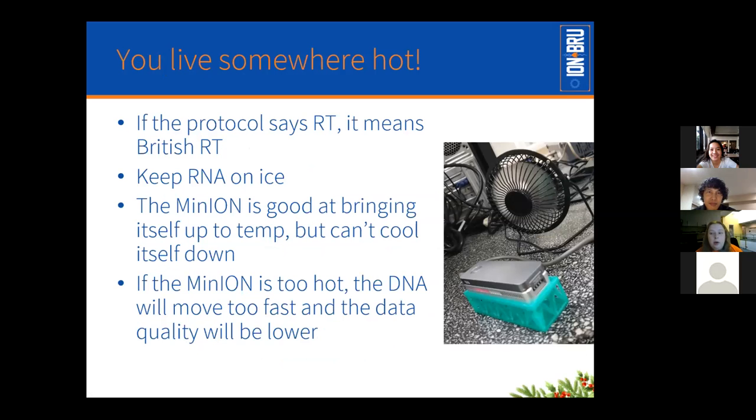You live somewhere hot. You're probably aware of this. It's hot where you live. And I'm sure you're used to protocols saying room temperature and not necessarily meaning room temperature. But definitely bear in mind that it's referring to British room temperature. And do keep your RNA and in fact most of the reagents on ice after they're thawed. One thing you might not have thought of is that the MinION does not do well in heat either. So it's very good at bringing itself up to temperature, but it cannot cool itself down. So when we were in the Philippines, we had these little mini desk fans, just USB desk fans pointed at the MinION the whole time.